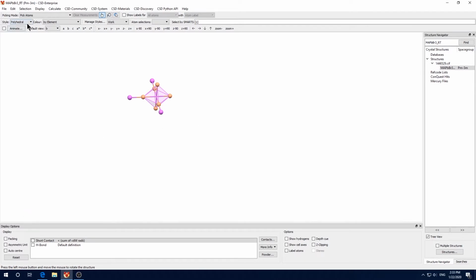And when you open it, it depends on the default style you choose. Most of the time it is ellipsoid, but you can try all the different styles one by one. For example, wireframe. It will show like this, wireframe as the name implies. By the way, if you want to zoom in and out, just hold your right mouse button, push up to zoom in, and drag down to zoom out.